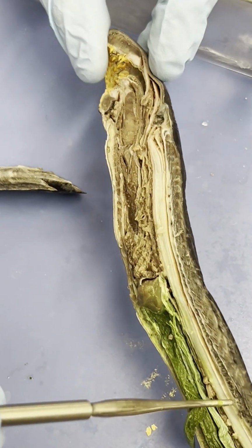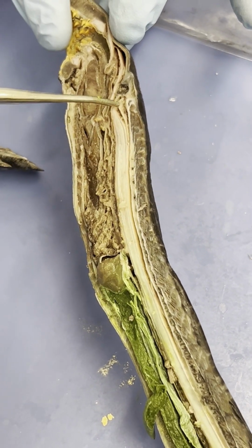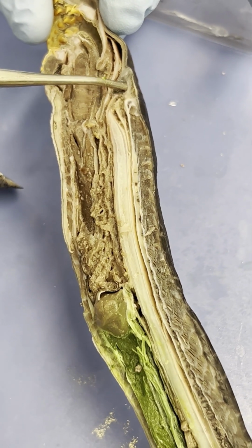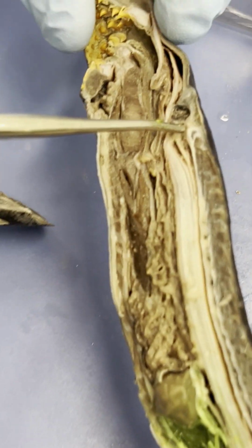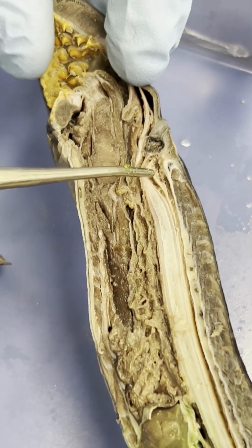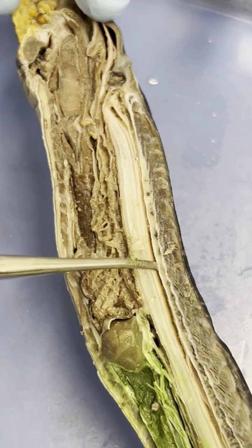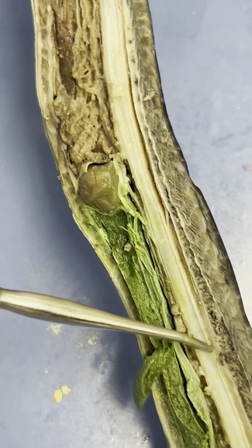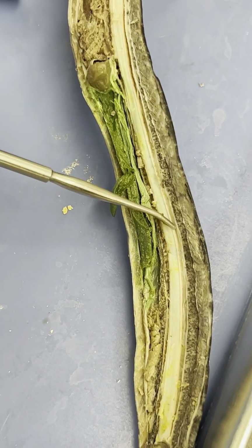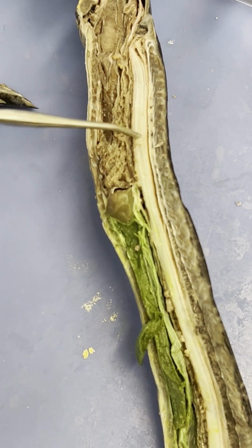So going back up anteriorly to this animal, right here we actually have the brain. We will talk about this later, but the brain is going to be right here. Unsurprisingly, the brain is attached to the spinal cord, which is all along this area right here and all the way down the animal. Ventral to this spinal cord is actually the notochord, which is right here.